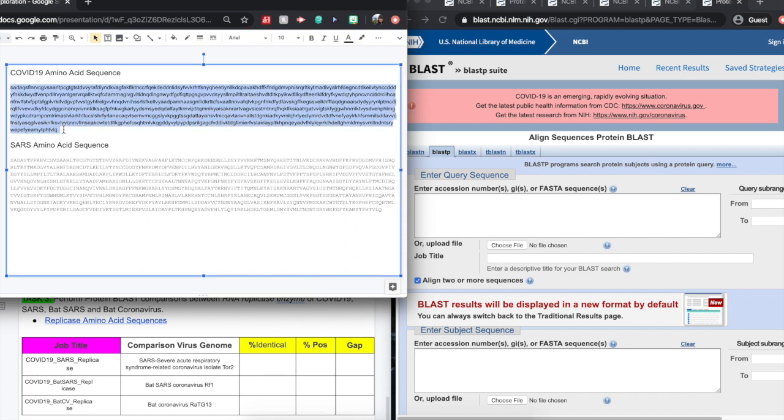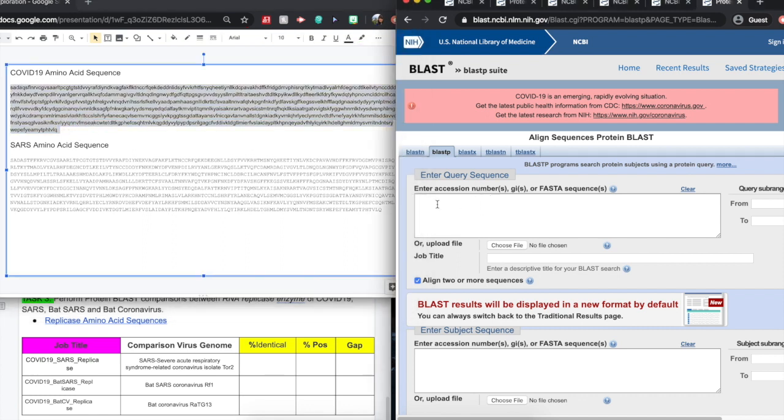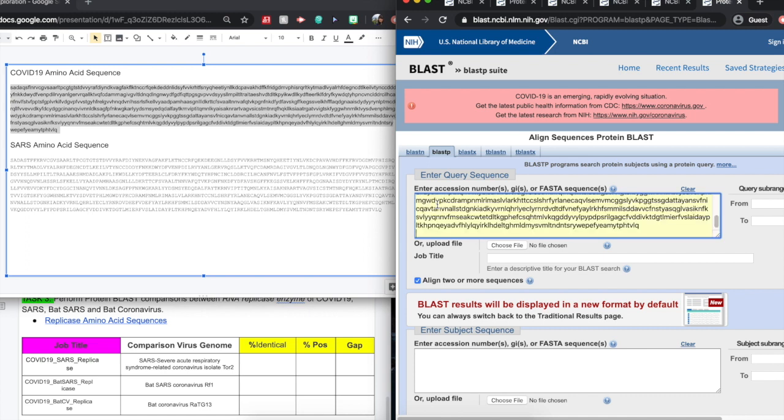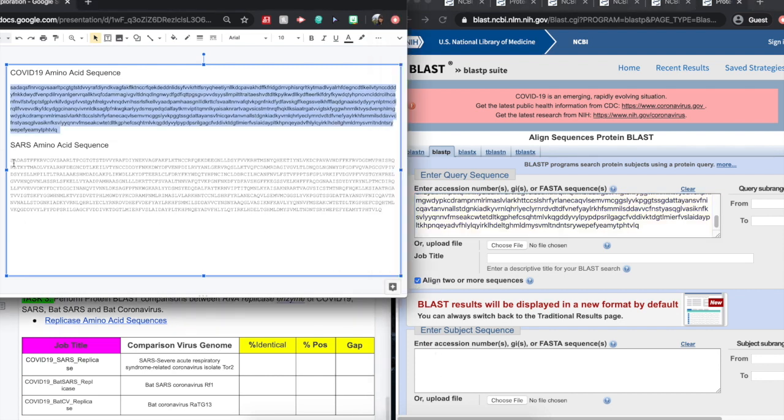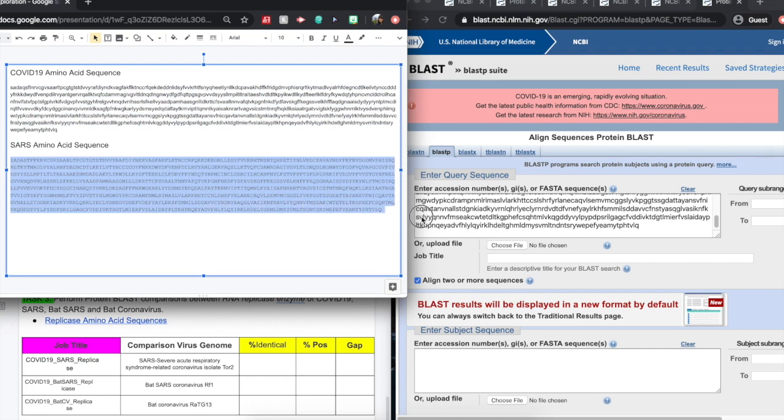We will be referring to the amino acid sequence provided here. So we'll select our COVID-19 amino acid sequence for the replicase, copy and paste it into the first query, and into our second. Remember, we have to select that align two or more sequences.